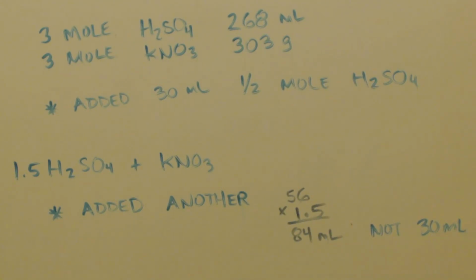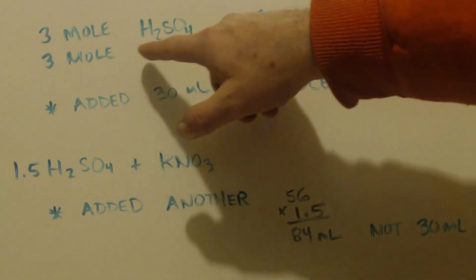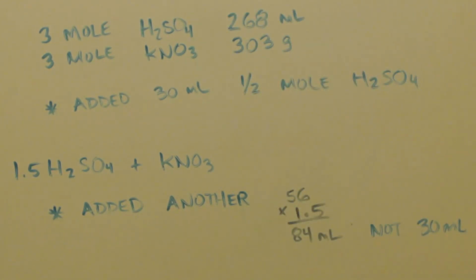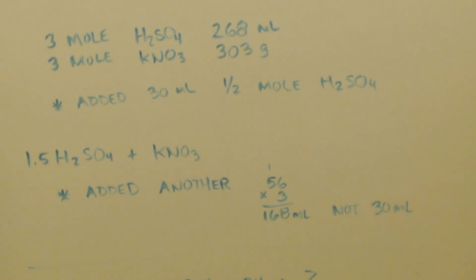And I didn't. So if you keep to the ratio, 1 mole of potassium nitrate to 1.5 moles of sulfuric acid, you'll get 93%. Now, if you add even more sulfuric acid, you might get more than 93%. You might get 95, 96, 97. I don't know. I wanted to see with this video, but as you can see, I made the mistake. So my suggestion, if you're going to try to make this, maybe add 2 moles of sulfuric acid and 1 mole of potassium nitrate and see if you get even better than 93% yield. You know what I mean? My thoughts are if you add enough sulfuric acid, you'll get 100% yield.